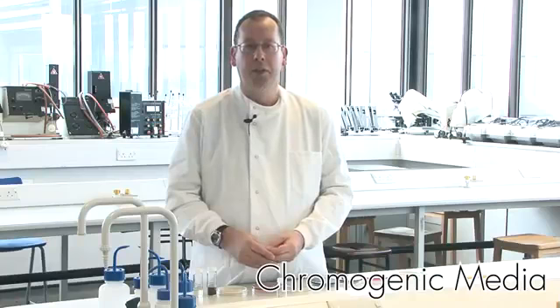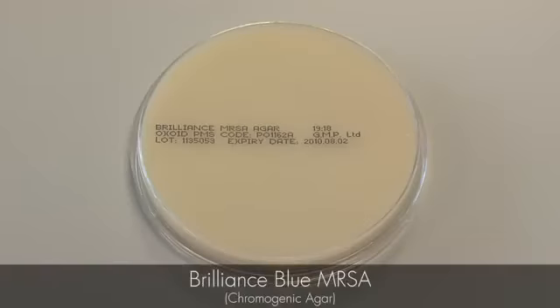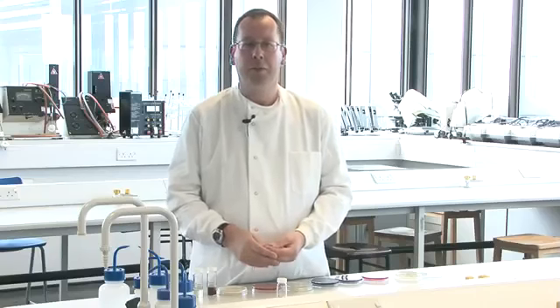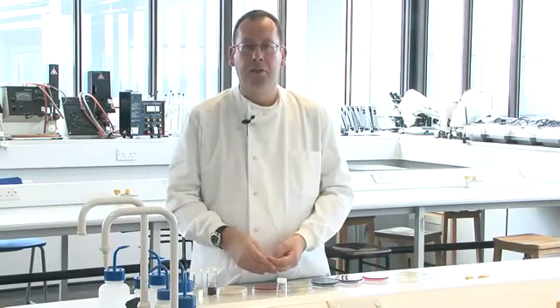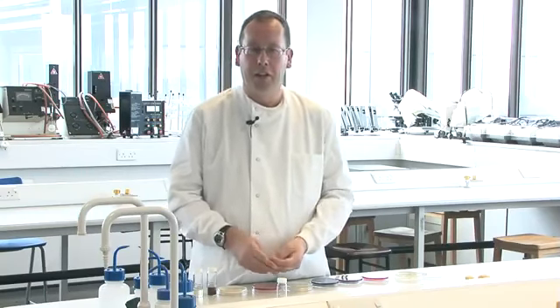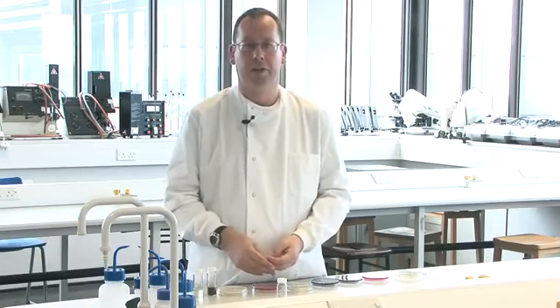Chromogenic media is a relatively recent development which is becoming widely used in laboratories. These types of media depend on us knowing a specific metabolic characteristic of the microorganism of interest. How this works is that multiple modified substrates are incorporated into the media. The substrates are modified by the addition of a chromogen, a molecule which produces colour when it's cleaved.